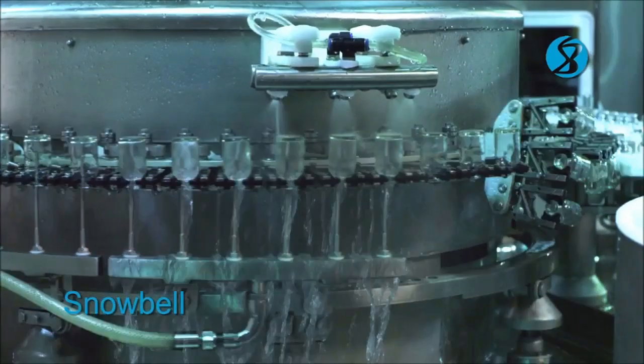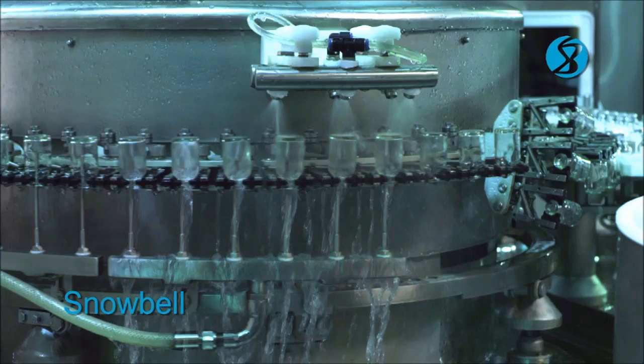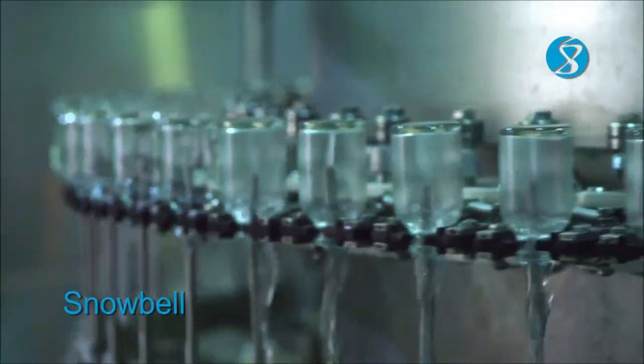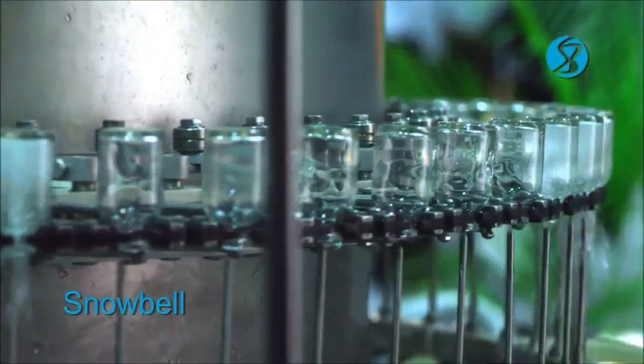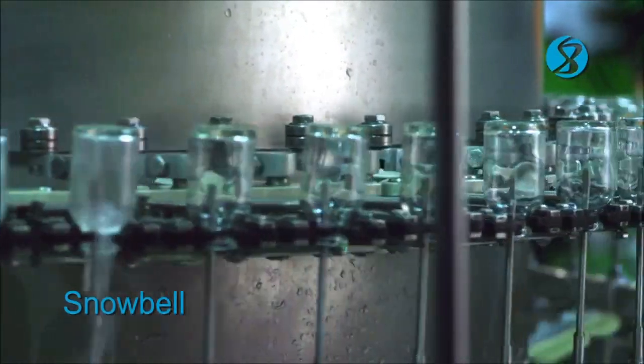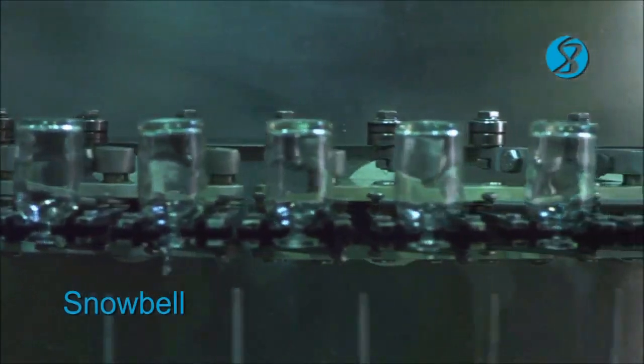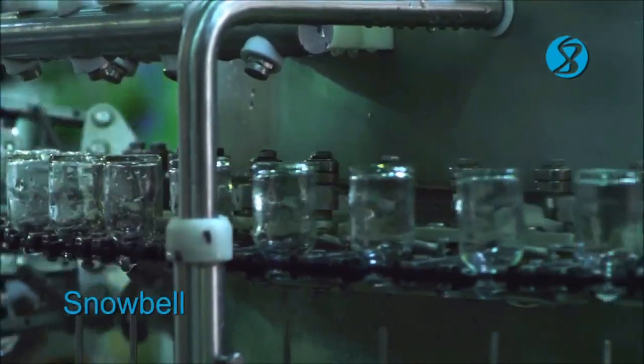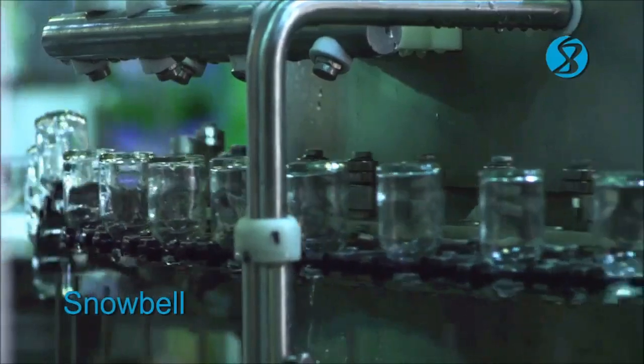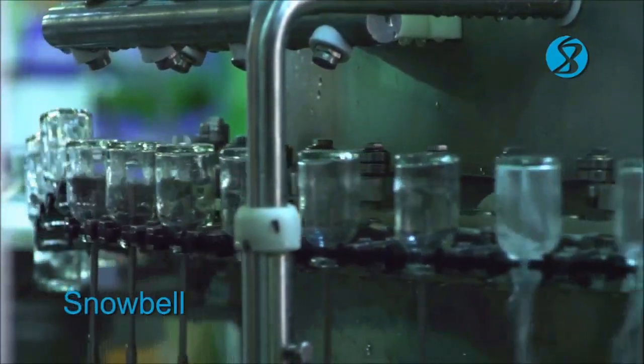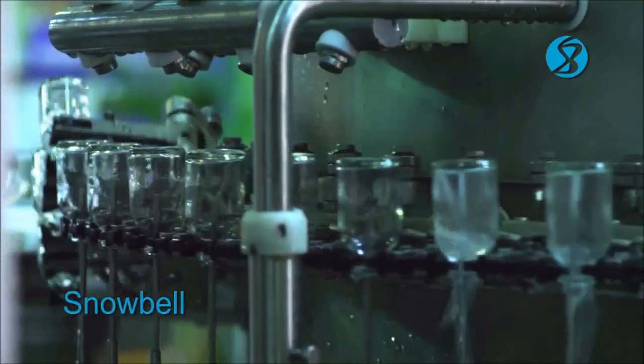The vials are cleaned internally and externally by a spray of recirculated water at the first station, internally blow-dried with compressed air at the second station, sprayed with purified water at the third station, internally blow-dried with compressed air at the fourth station, sprayed with WFI at the fifth station, and finally, internally and externally blow-dried with compressed air.